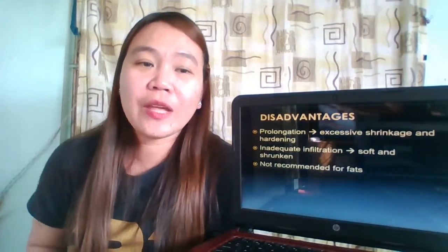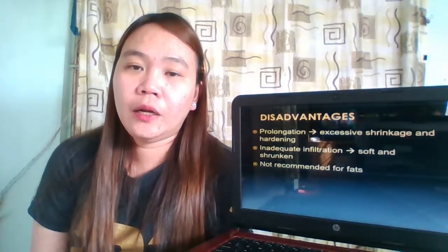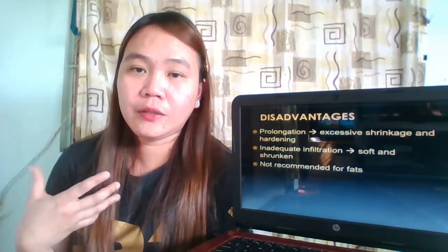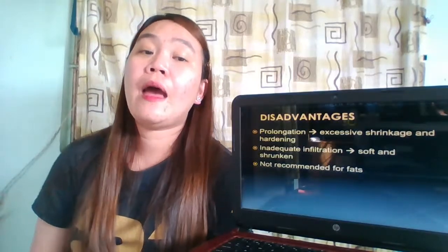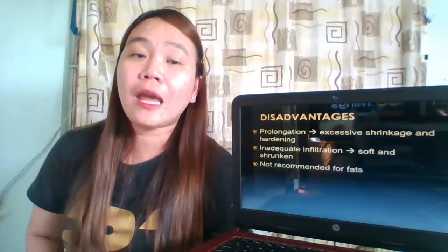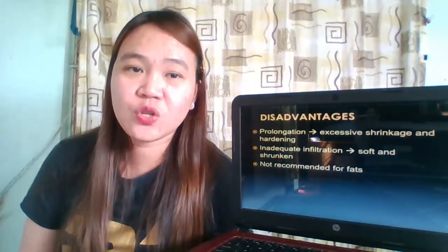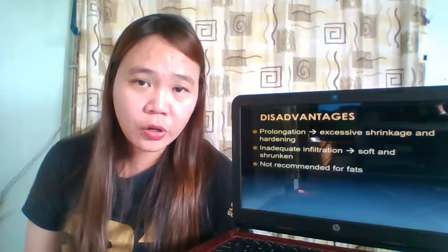Anyway, prolongation. When we say prolongation, it pertains to the immersion of your tissue sample for prolonged periods of time in your paraffin. Prolongation will result to excessive shrinkage and hardening. So I repeat, prolongation will result to excessive shrinkage and hardening.